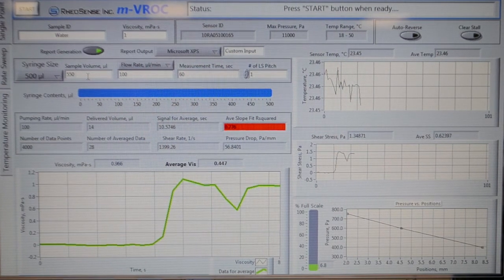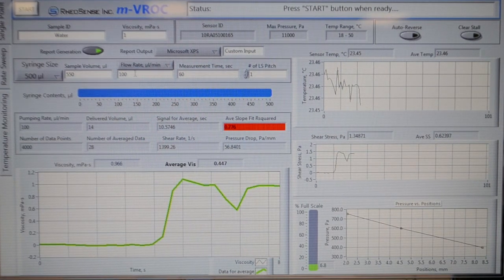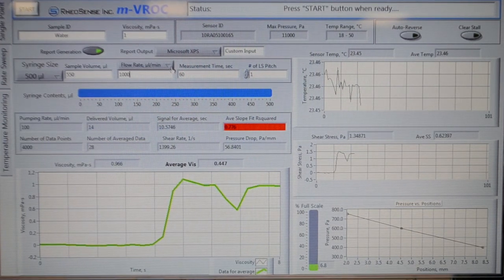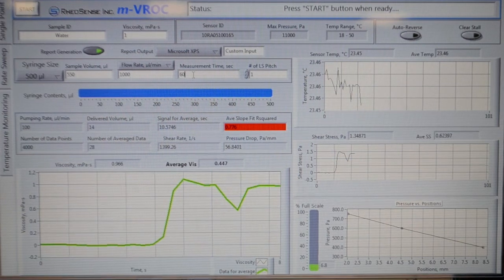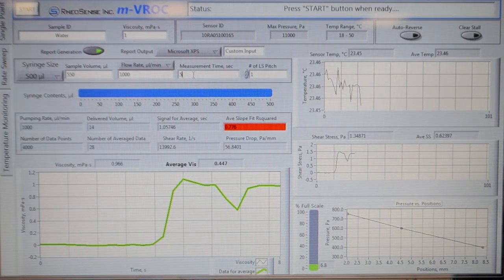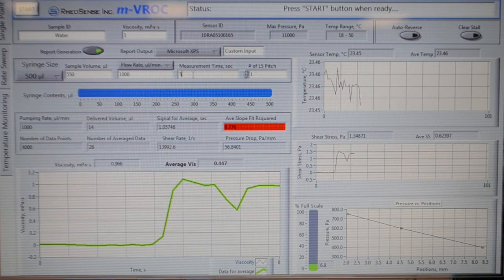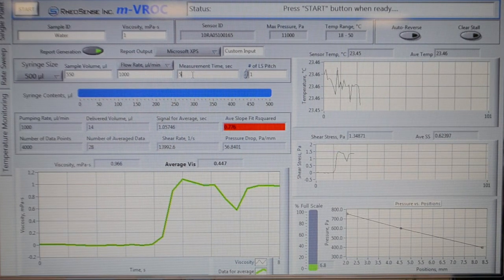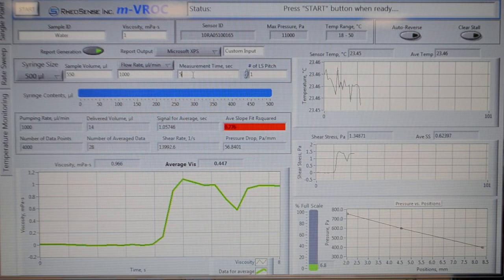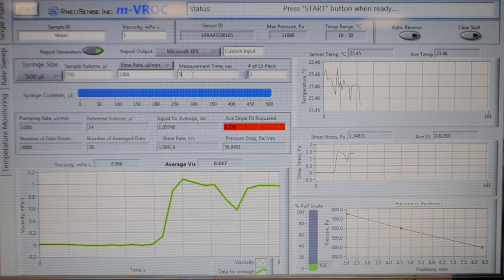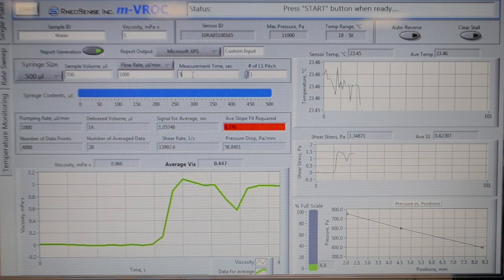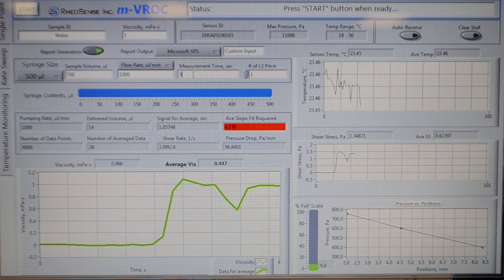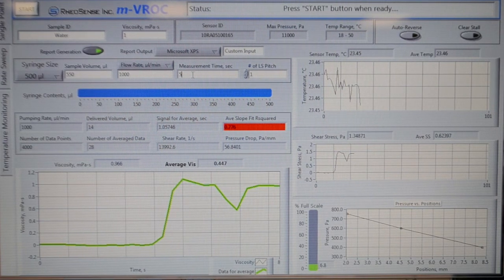Let's select the flow rate to 1000 microliter per minute and the measurement time to 5 seconds. Please keep in mind that this particular flow rate is designed for water, which has a viscosity value at around 1 centipoise. If you have a more viscous sample, say isopropanol, which has a viscosity value at around 2 centipoise, you should scale the flow rate to be slower and the run time to be longer.